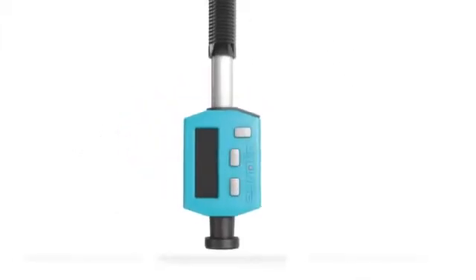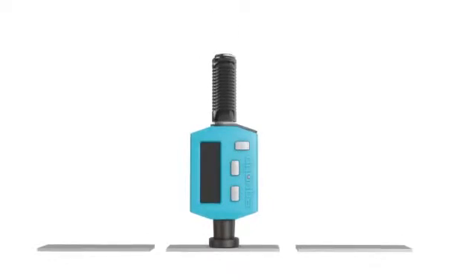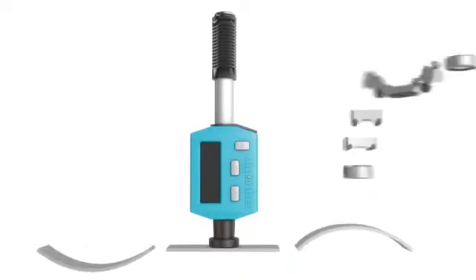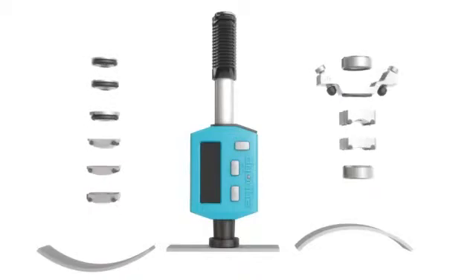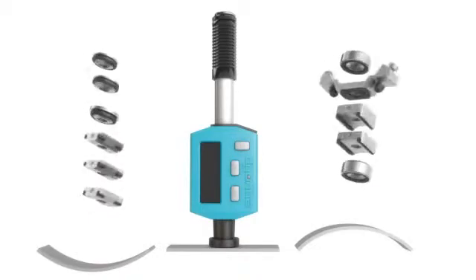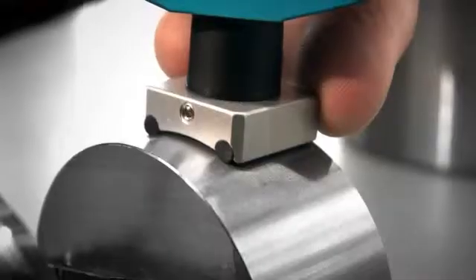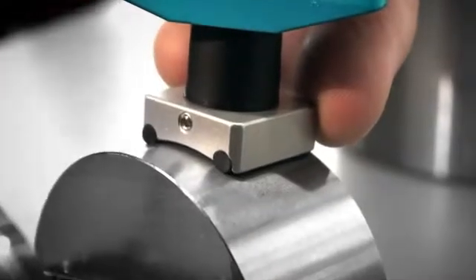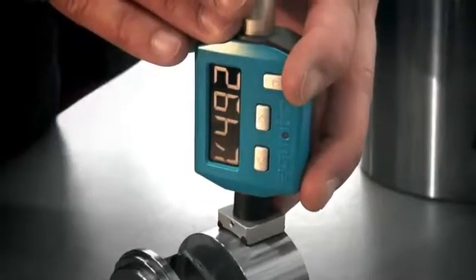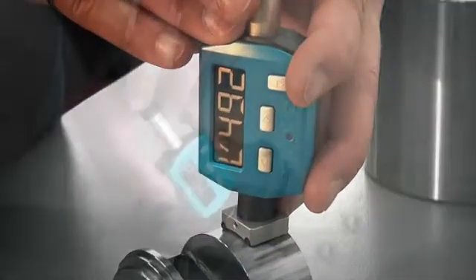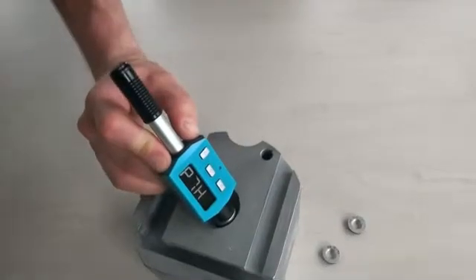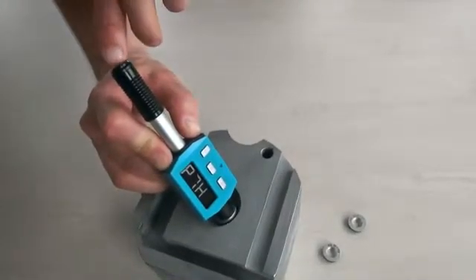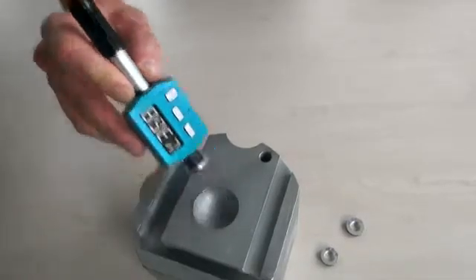Ideally, a measurement should be done on flat surfaces. But if your test piece is concave or convex, ProSec offers different support rings as accessories. If the surface is convex, as seen here, the support ring Z should be used. If the surface is concave, use the K support rings. Select the one that best matches the sample curvature.